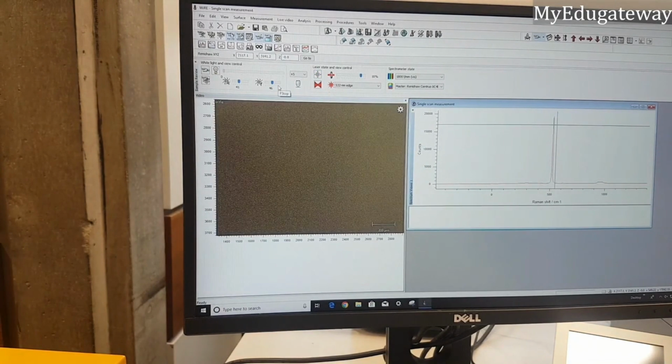Okay, so the alignment is, okay, so this is the peak and this is the alignment here.